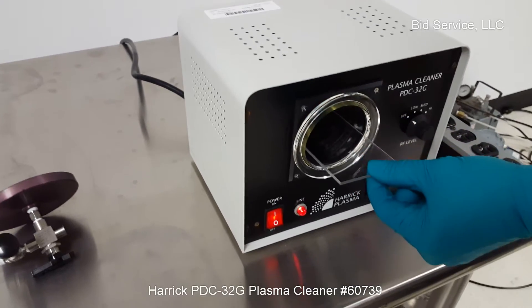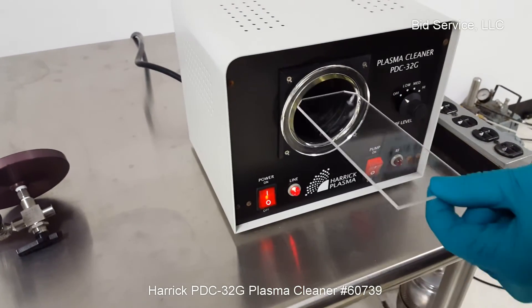I just want to show you that there's a shelf in here. It comes completely out — just place it in here.